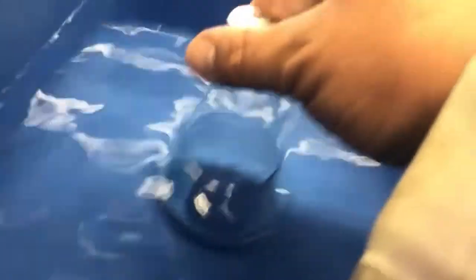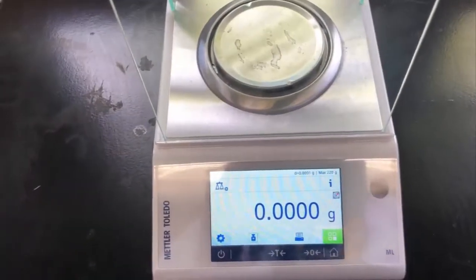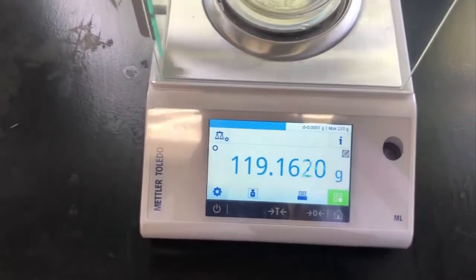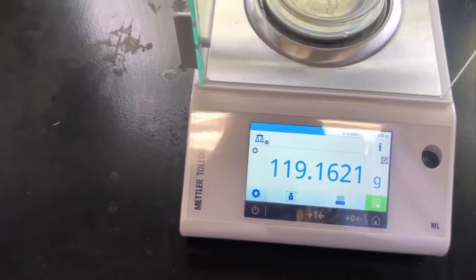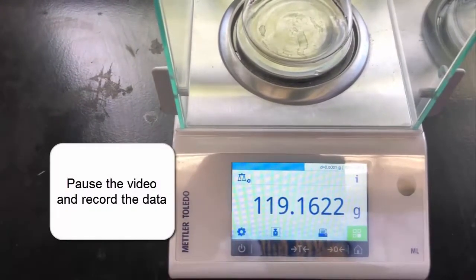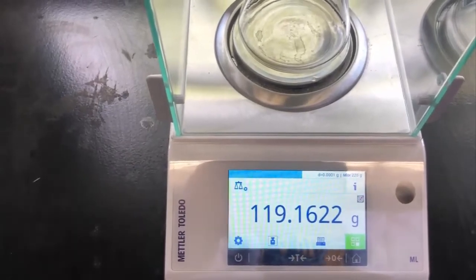I'm going to pause this here and we'll come back and weigh it. So here we are — I've tared out the balance. I'll put this back in there. I dried it off well also. And that's our final mass.